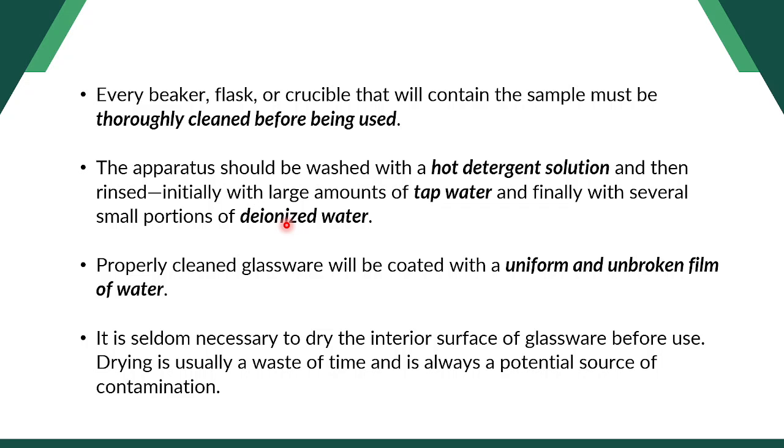So, di ba, gamit kang liquid dishwashing sa paghugas sa mga glasswares. Now, after that, ibanlaw siya with the use of tap water. Now, ang pinaka-last nga ihugas nga tubig aning mga apparatus should be deionized water. Now, what do I mean by deionized water?